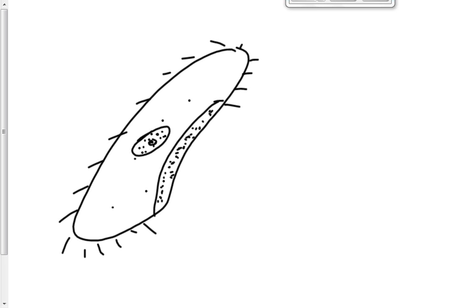I'm marking you strictly on format, unless, of course, your paramecium looks like a dragon. Okay, then you're just fooling around. So make sure it generally looks like the thing you looked at. The amoeba is great because all amoebas look different. They're a blob, and they're very easy to draw as a result. So that'll be the enjoyable part if you have my artistic ability. All right, so those are the big things, guys, about your lab drawings.